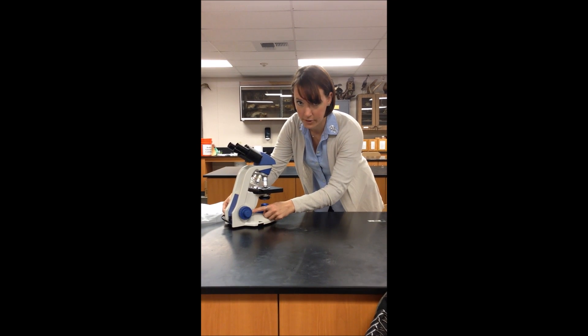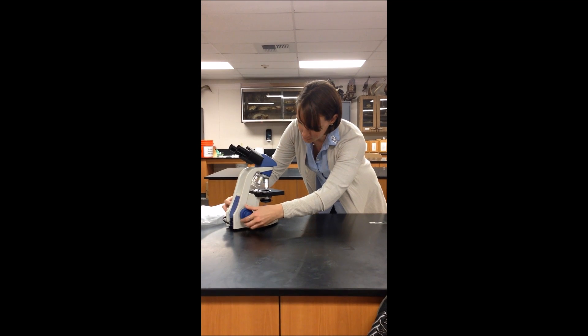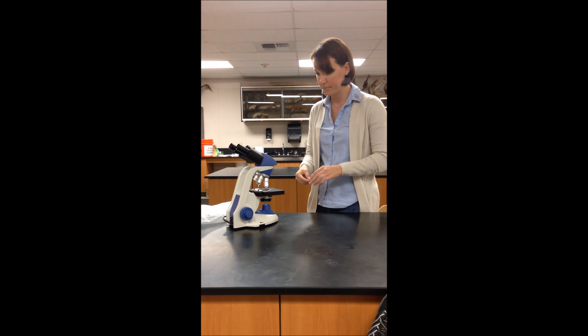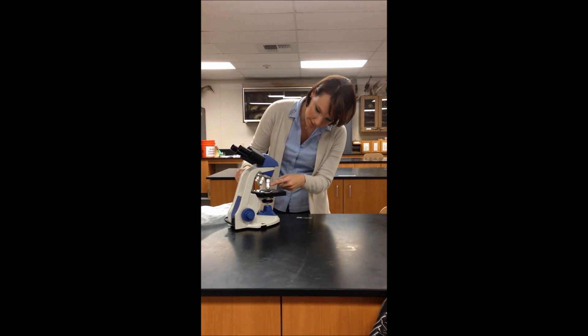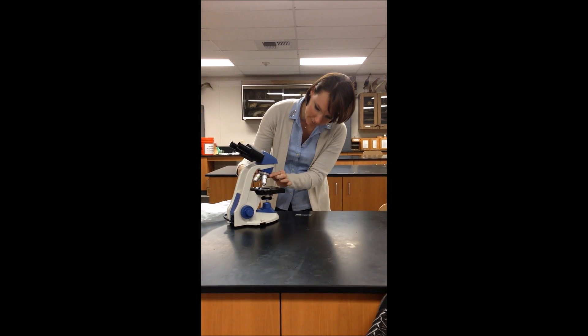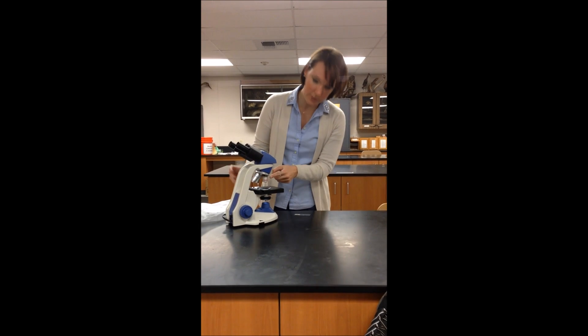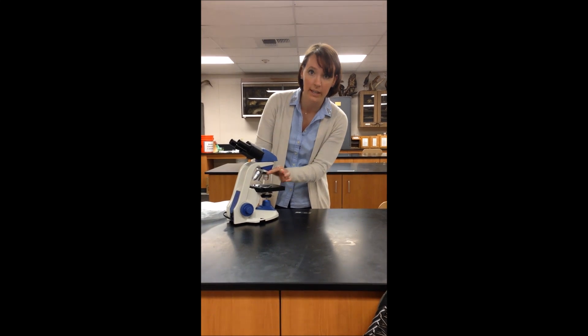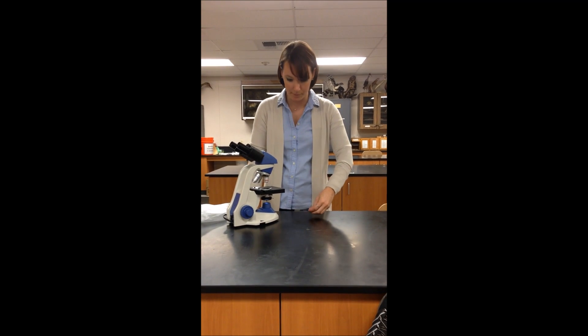You're going to use the coarse focus, this large knob here, to bring the stage to a safe position to put in your slide. The objectives should be placed on the lowest objective, which is the 4x. You can read the number here. The objective will click into place when it is in the proper position.